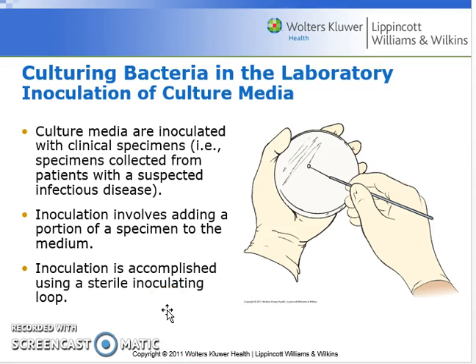You make sure this is completely sterile, and then incubate your plates for 48 hours at either room temperature, 25 degrees Celsius, or 37 degrees Celsius, or whatever optimal growth temperature you think the organisms you're looking for will grow at. So you do that inoculation, and then you have to wait.